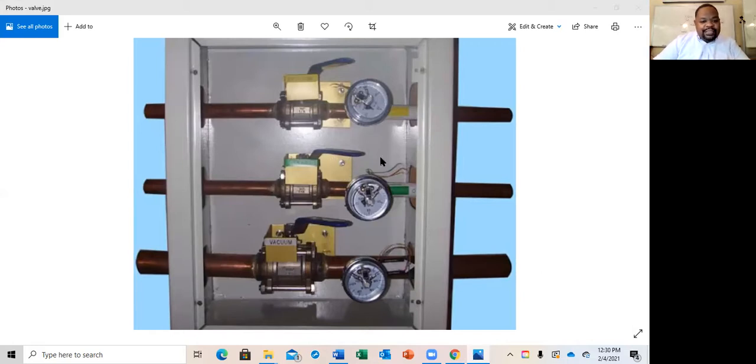So you would come over to Two Sherry and open up this little glass window. It's like a little glass window. You open it up, plastic. You'll take your hand right here on this valve and turn it off. Right? See, all of them are open. They're over to the right, they're open. But when you pull it straight up and down, pull it over this way, it's going to cut it off. Notice right here, you can't really see it, but this is another gauge right here. It tells you the pressure inside of this line right here.